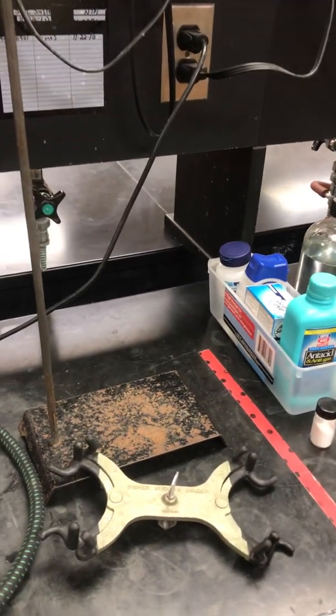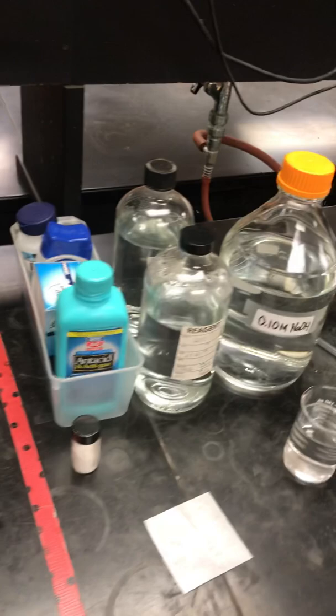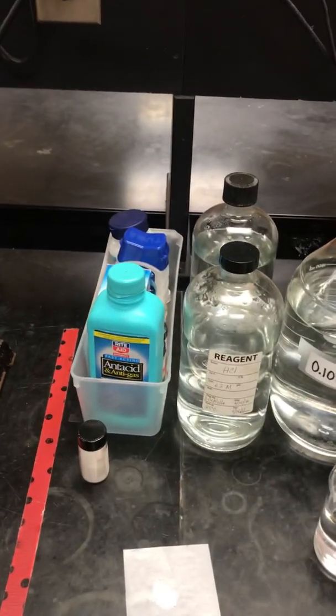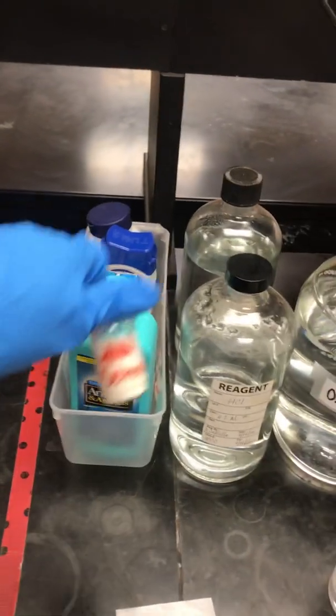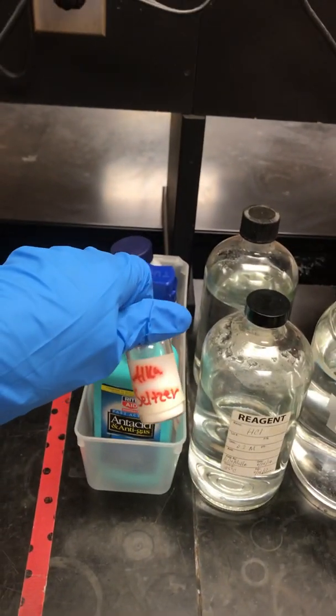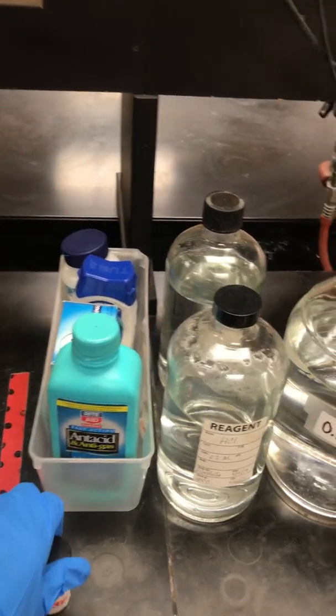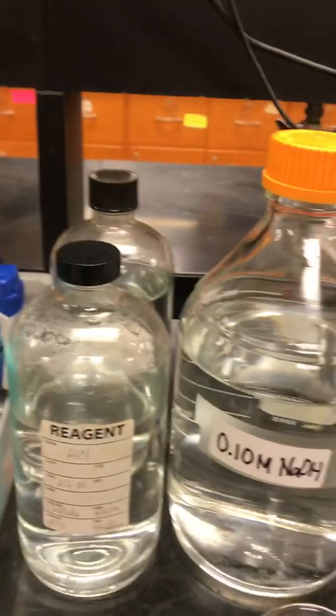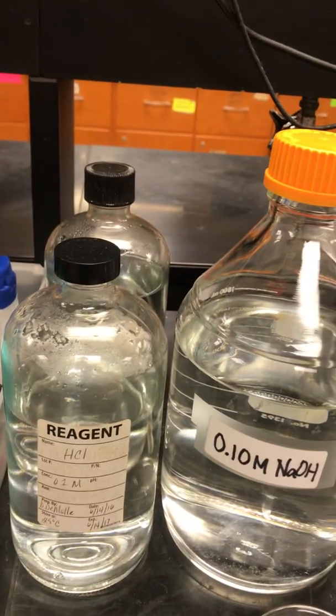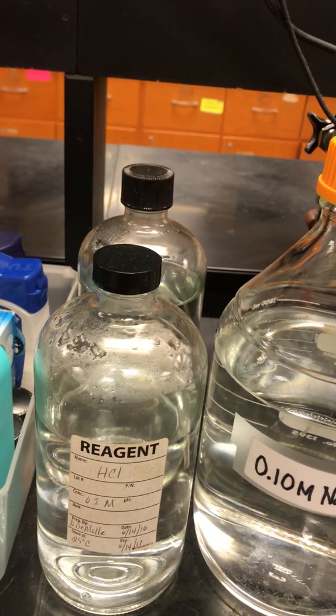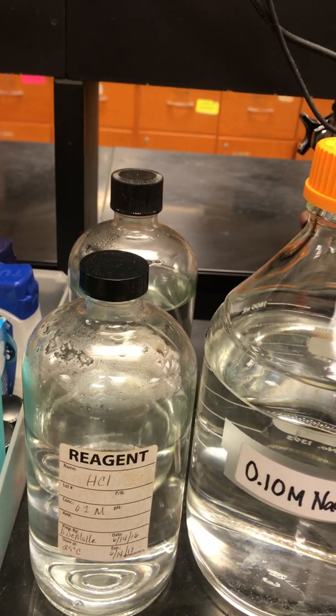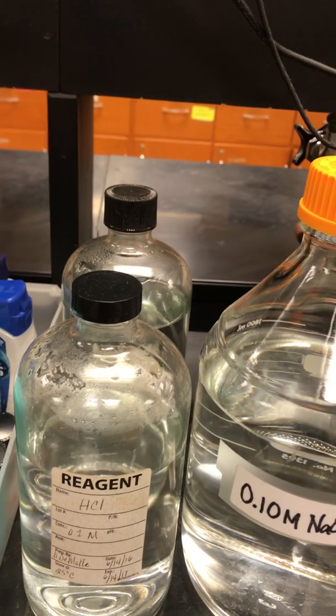We're setting up the antacid analysis lab. You're going to have your reagents such as your antacid already pulverized with the name on there. Make sure you write the name. You're going to have your solutions, your HCl and your sodium hydroxide. Look on the bottle and write your concentrations and molarity down on your report sheet.